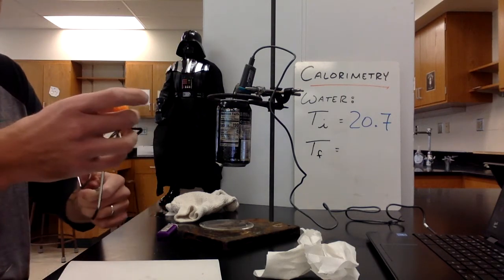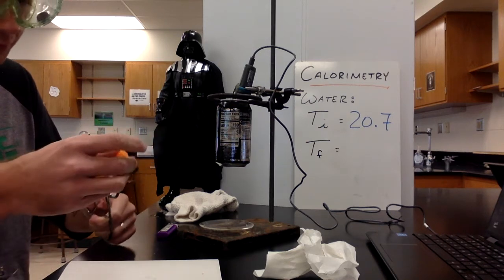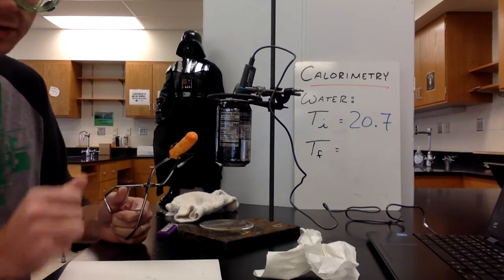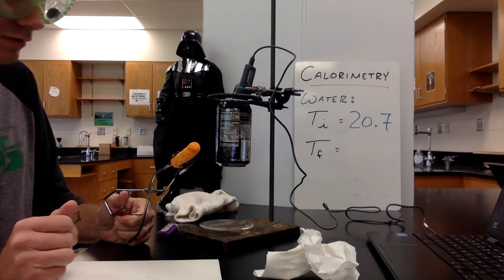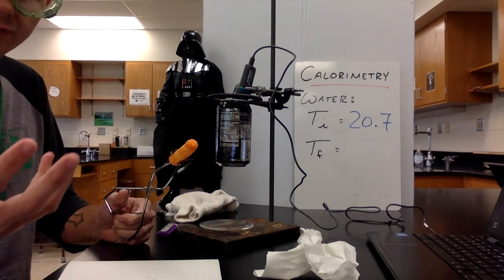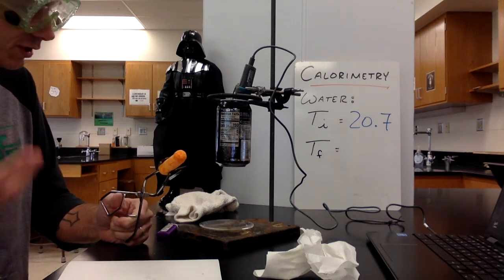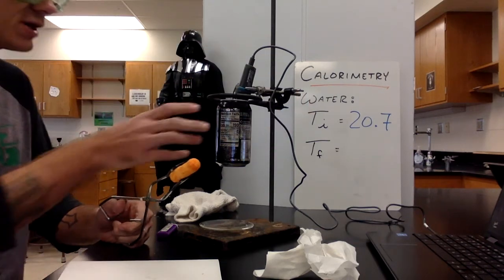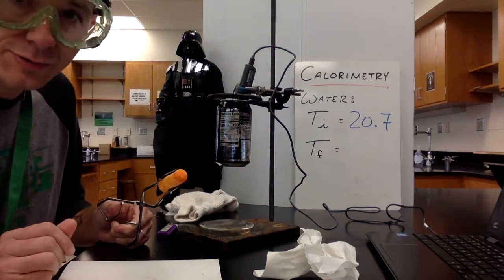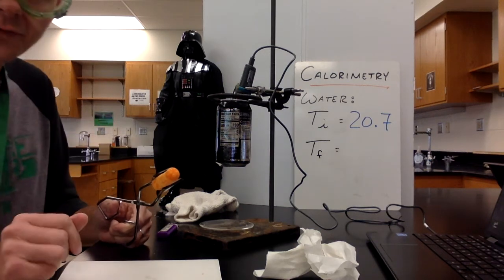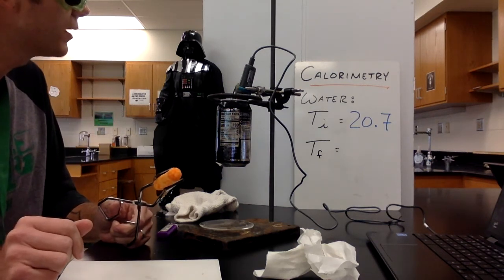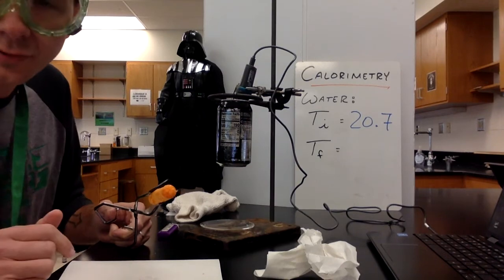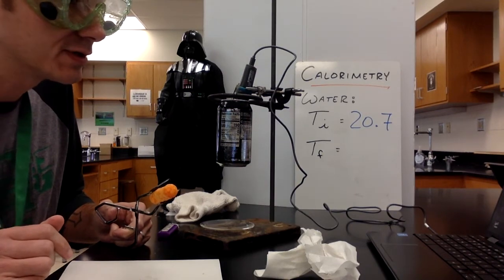I've seen some fun experiments with cheese curls. We're going to release the chemical energy that's currently in our cheese curl and transfer it into heat energy. We're going to monitor the temperature change of this water in my calorimetry device. We have 50 milliliters of water in here. I took an initial temperature of 20.7 degrees Celsius.